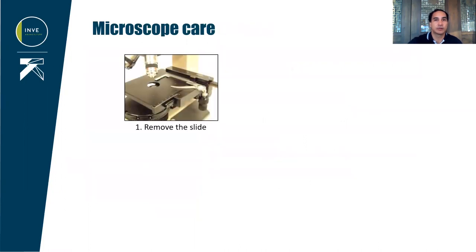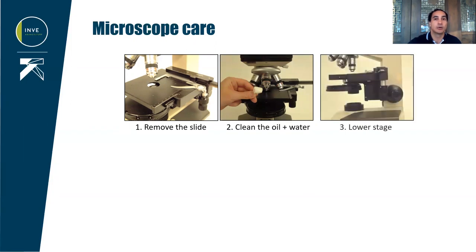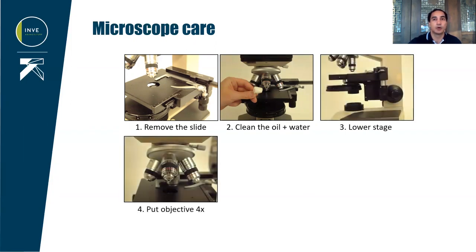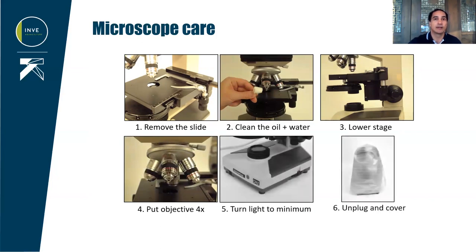After using a microscope, it is important to store it correctly for the next user. Remove your slide. If you've been using oil, clean the objective with paper and clean any sea water that may be on metal components. Lower the stage, put the 4x objective in position, turn the lights to minimum, and unplug and cover the microscope to protect it from dust.